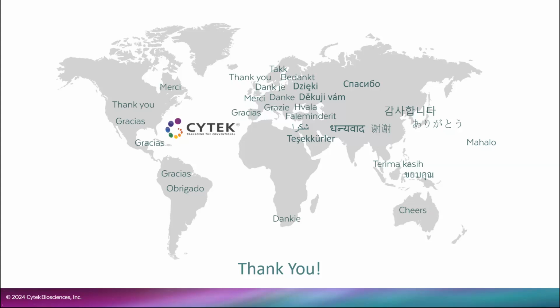So we highly recommend that if you identify that your sample has this diverse profile of autofluorescence, or if your sample, like last week we saw, has high autofluorescence, even if it's just one population, then go for spectral, look at the unstained, look at the profile, look at the diversity of populations in there, and then decide based on the workflows that I explained which one you would go for, but spectral would be the best way to go.